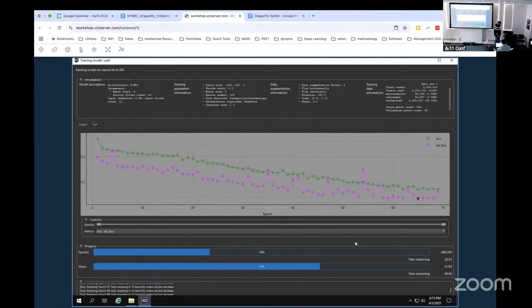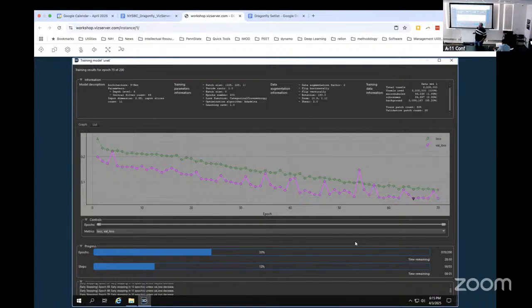If I do the data collection one day, it'll take a long time to save, and then transfer to the PC, and then usually that night I'll transfer it from the HPC to my workstation. It's like a couple hours. And then the next day I'll just continue.